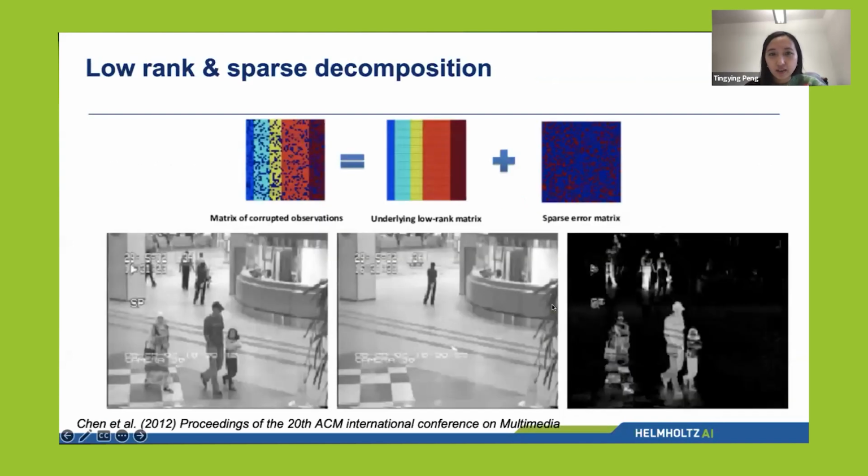So we developed our method, which is called BaSiC, published in Nature Communications in 2017. That method itself is based on something called low rank and sparse decomposition. I won't go through the details of how it works, but I can show you an example to give the intuition of why it works. This low rank and sparse decomposition is used for video foreground and background decomposition.